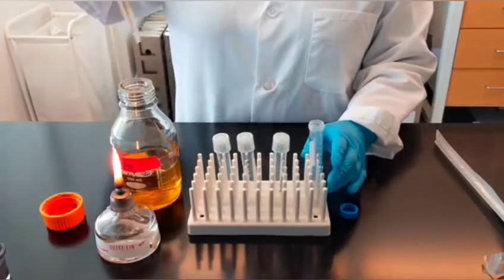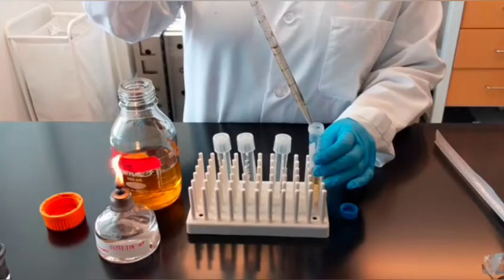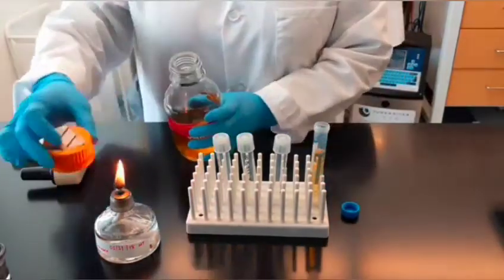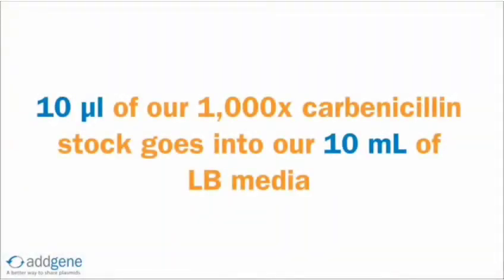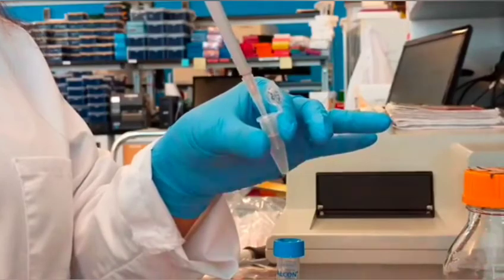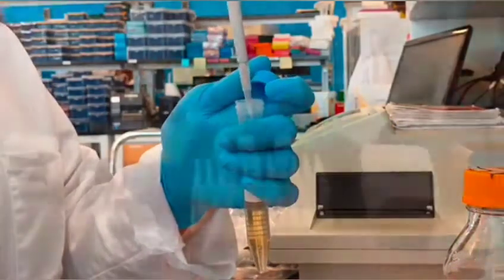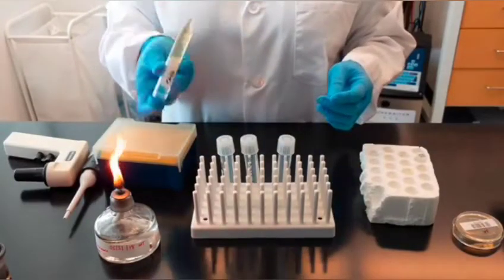Since we will need 10 mL of media for our inoculations, we will first transfer 10 mL of LB media to a 15 mL conical tube. Now we are ready to add the antibiotics. We have 10 mL of media, so we will need 10 µL of the 1000X carbenicillin stock. Add the appropriate amount of antibiotics to the media, making sure that the pipette tip does not touch the neck of the bottle. Reflame the tube, cap with the lid, and invert to mix in the antibiotic.